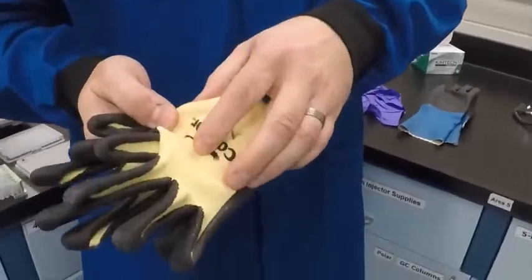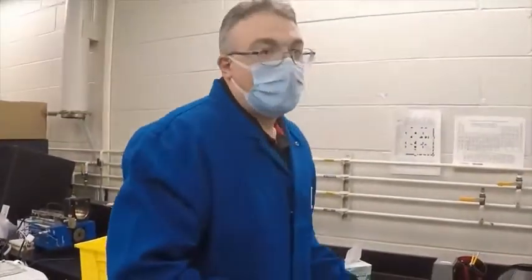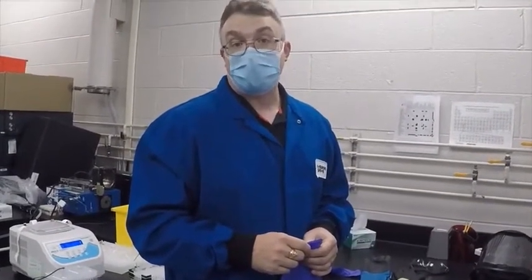These particular gloves have a Kevlar back with a nitrile coating for extra grip. Please check with your safety officer for what gloves are recommended for your specific actions. Now I'd like to discuss the proper donning and doffing of your chemical gloves.